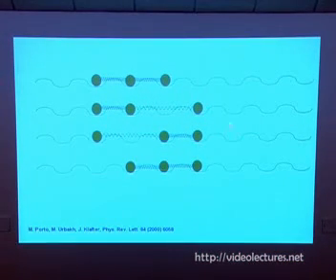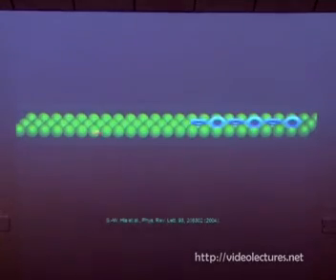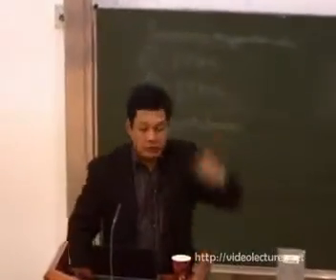In order to do that, we must have an isolated system. So in our case, what happened is that the molecule is a lattice match with the substrate, and it physisorbs at liquid helium temperature. So we assume that this molecule's energy transfer is a bit slower, so it can maintain up to some distance, considered as a relatively isolated system. So this is our model, how the molecules are moving on the substrate after releasing the tip. Basically what we did is that with the tip, we excited the torsional mode of the molecule, and when we release the tip, it triggers the movement.